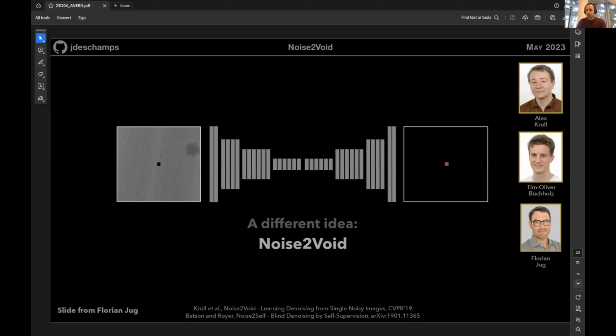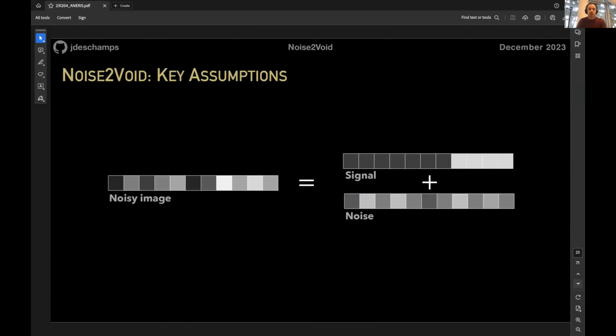a single pixel value is. Now, the problem is that if you keep this pixel value in the input, it's very easy for the network to know what the pixel value is. So what we do is mask in the input certain pixels for efficiency, a certain number of them, and then we train the network just on this one image, on this one corpus of images, to estimate what the pixel value is from the surrounding pixels. So that's a bit of a strange idea, a bit of a departure from the common deep learning scheme.